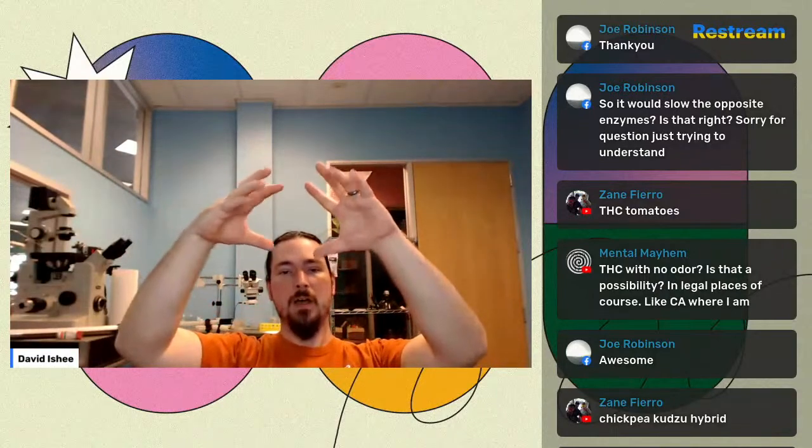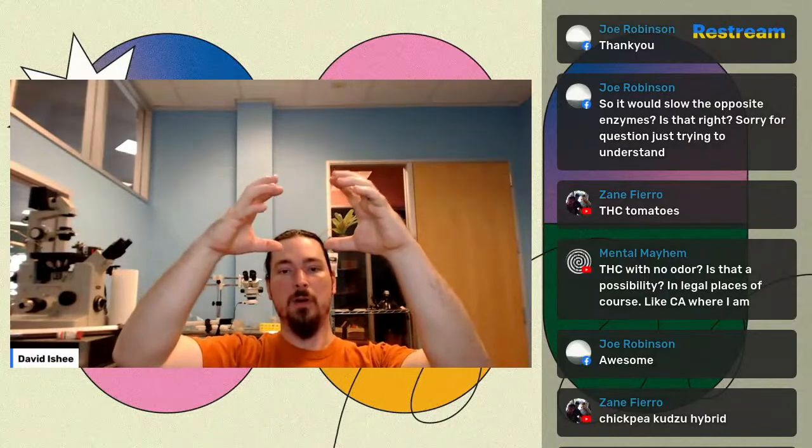Another thing that we're going to try and do is protoplast fusion. So I think that will be a really cool kit. You take a plant cell and break down its hard cell wall so that you get a flexible, juicy cell that's more like an animal cell, and then you can merge them together, bloop, and that's another way of getting polyploids. You take two cells and just go burr, and you end up with a double cell, basically. It's got two nuclei, but when it tries to divide, it'll dissolve the nuclear membranes and make double the amount of chromosomes, but they don't all have to be from the same species.